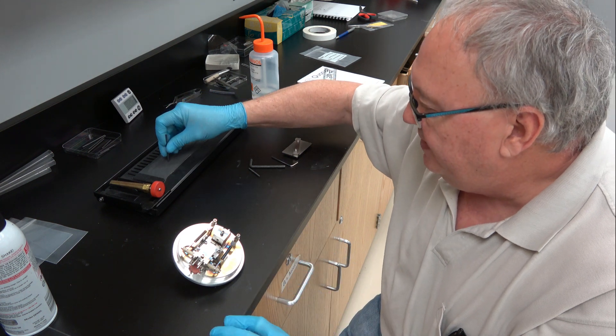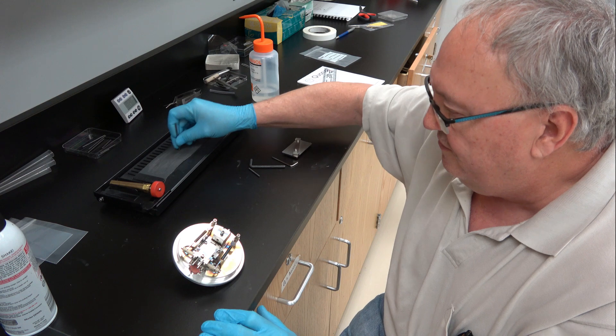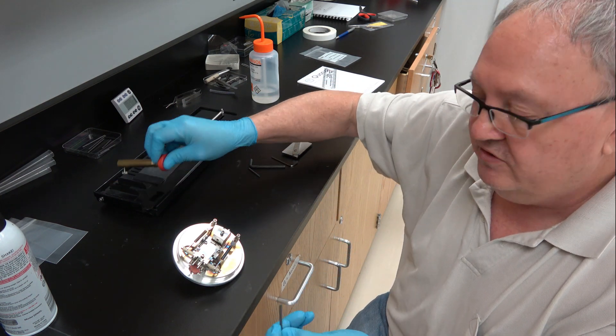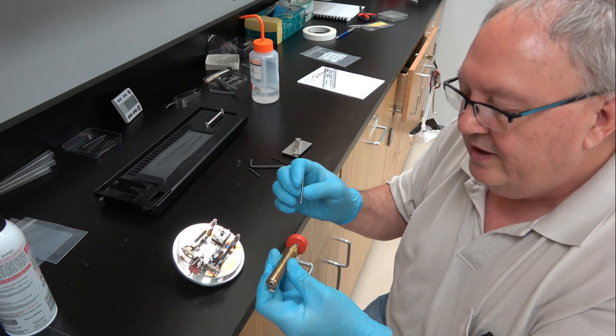That's what you can fit into the machine if you remove the insert from the machine, which I prefer to do because it makes it much more comfortable to set it up.